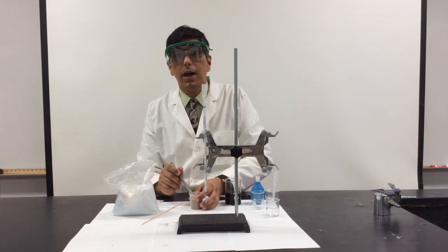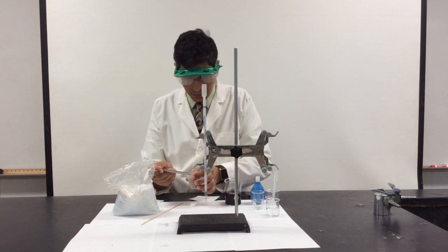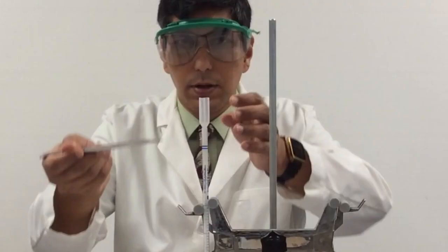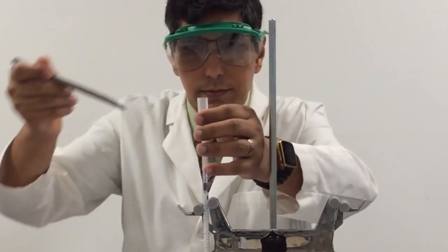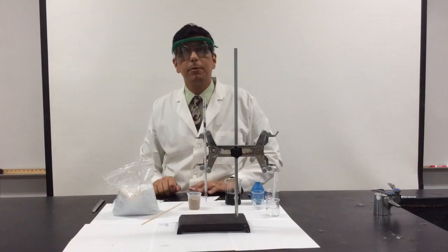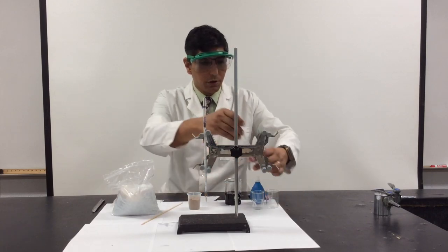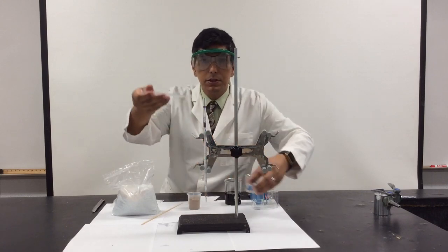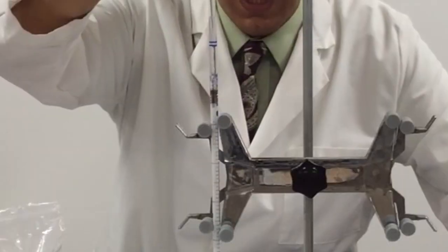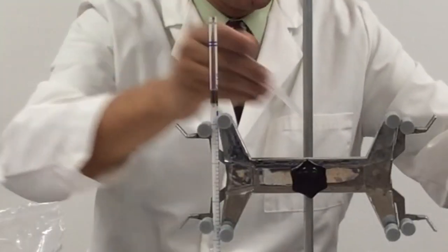And to top it all off, I'm going to add a little bit of sand to the top of the column. Now I'm going to use this to separate the dyes out of grape Kool-Aid. The first thing that you want to do though, before you actually start the separation, is to put some distilled water into the top of the column to moisten the column.